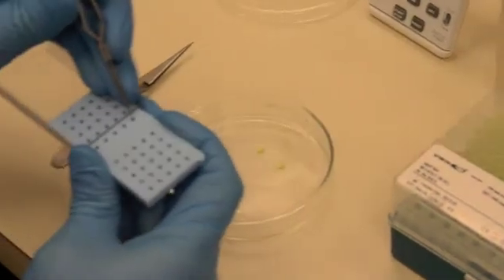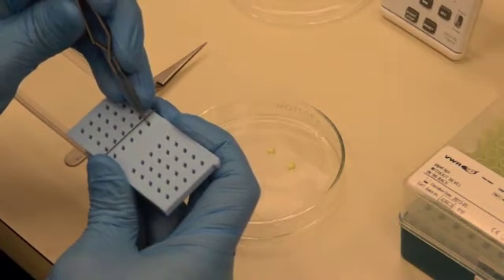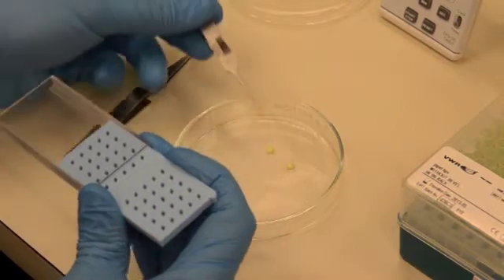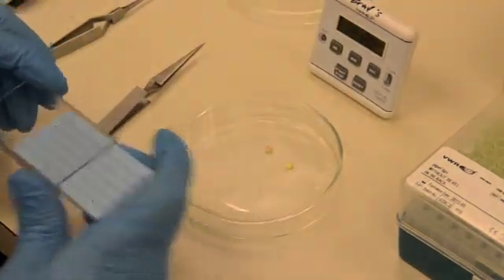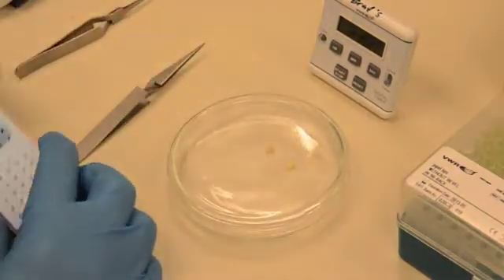Take your sample out of the box. Place your grid onto the drop of stain, sample side on the stain, and start your timer. Wait one minute before you place the next grid onto the adjacent droplet.